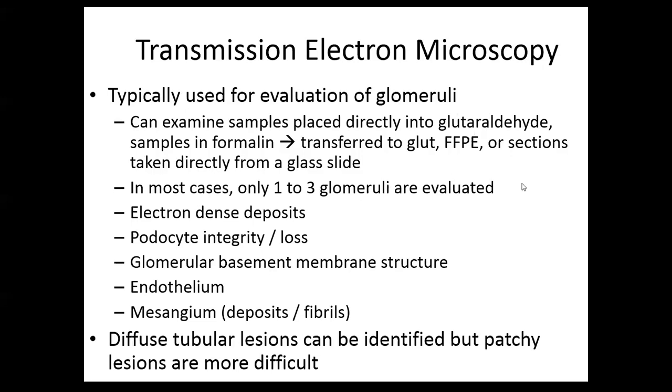The other thing we can do, which we're doing right now for a case that came as a consult from Penn, is they had already looked at the paraffin block. So they had formalin-fixed paraffin embedded tissue, and they had looked at the glass slide, and then they sent us the block, and we are melting down the block, and we are taking those cores from that block, and we are post-fixing it in glutaraldehyde.